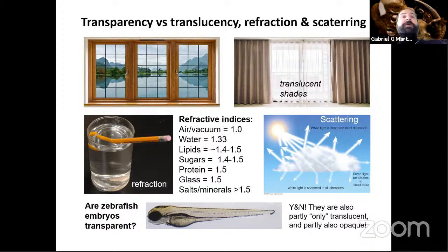The concept of transparency and translucency may not be immediate to some people. If I ask what a transparent thing is, I think most of you will immediately think of a window, a glass window, and the ability to see through glass very clearly. That's the common day definition of transparency.